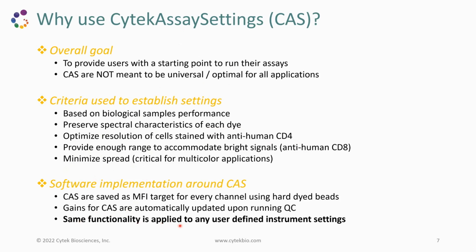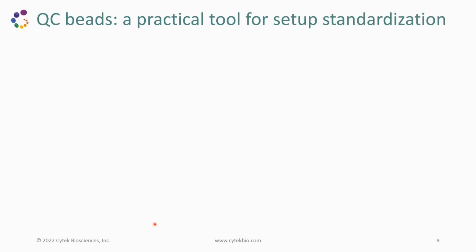If you have your favorite settings, when you run QC, those follow the same process as the Cytek assay settings, and they are also updated. So the same functionality and the same strategy around any user settings.